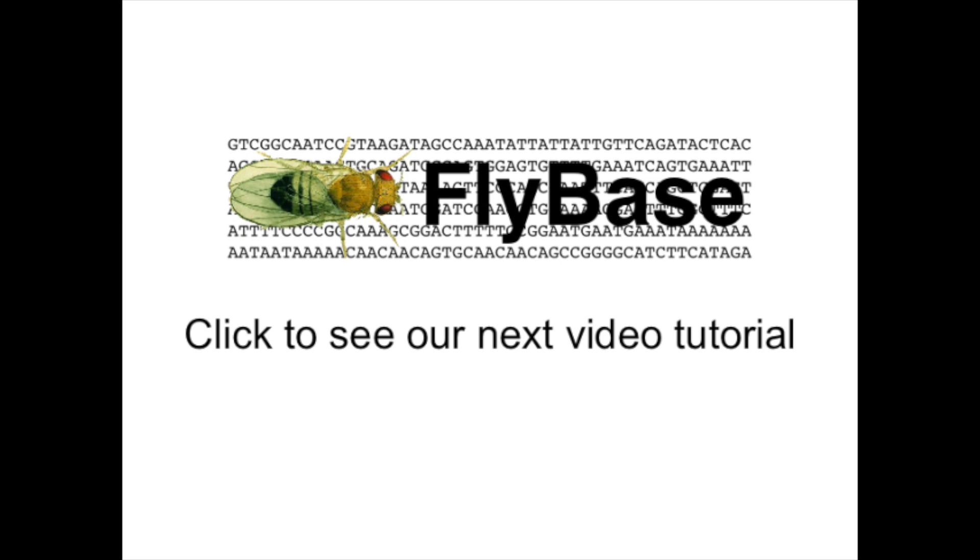You may want to query the ARNESIC data, for example to find genes with similar expression patterns, or to obtain a quantitative output for your gene of interest. Options for this type of queries will be presented in subsequent tutorials.